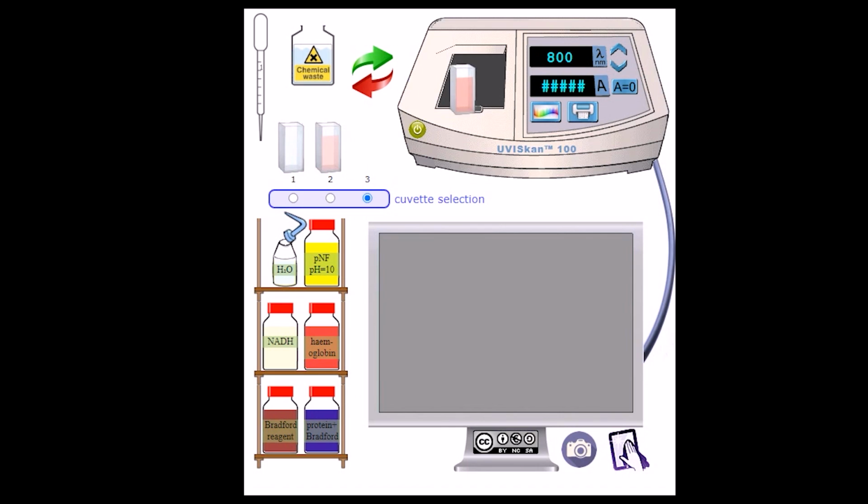And this is important because we, as chemists, always determine the concentration of hemoglobin when some patient needs to go to surgery or if they need blood transfusions. So it's common in our daily work. And we finish the experiment just by throwing everything into the chemical waste, and that's it.